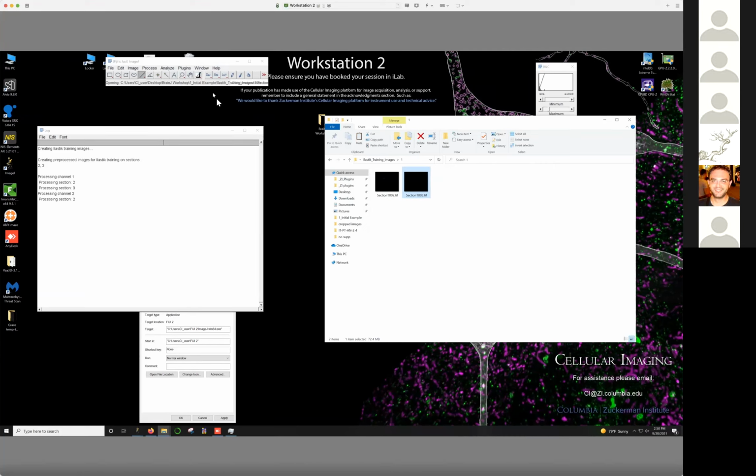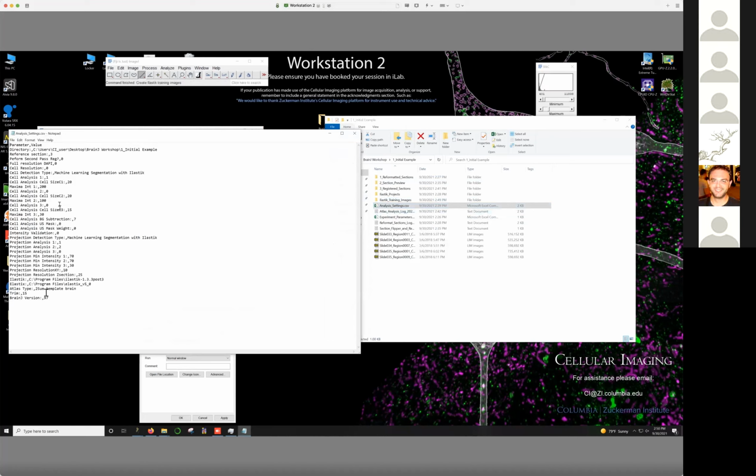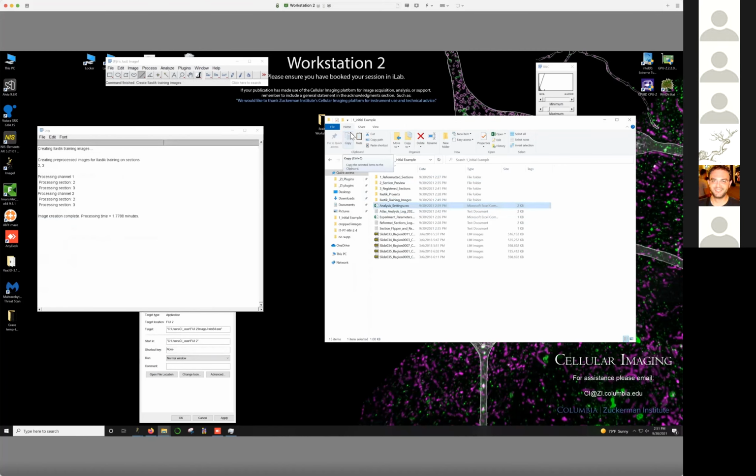Yeah, sure. So did it now use the radius of 7 that you previously set? Yeah, it'll look in the folder and see, okay, what's this pipeline for this brain going to be doing? And if I open this up, it'll see, okay, background subtraction is set to 7. So that's what I'm going to use to make these files. And it's just as simple as that. It's just that one step really gives Ilastik an advantage in being able to do the pixel probabilities. So it's definitely worth doing.